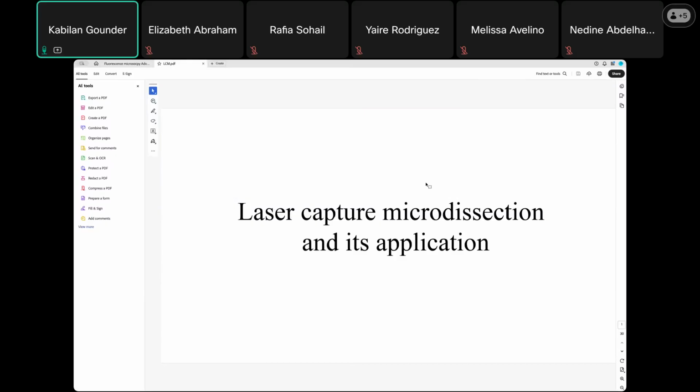So with this, we completed fluorescence microscopy and light microscopy. The next is laser capture microdissection and its application.